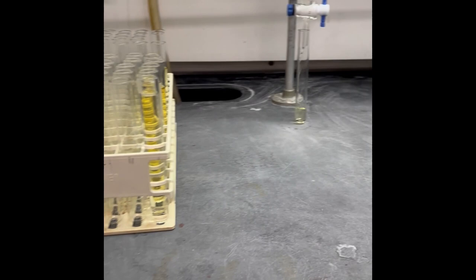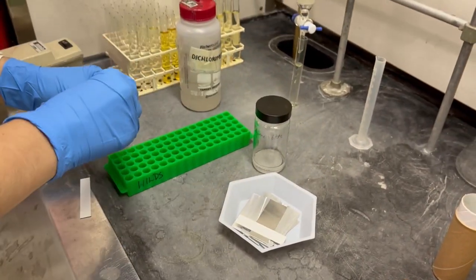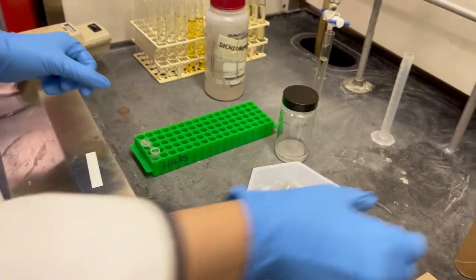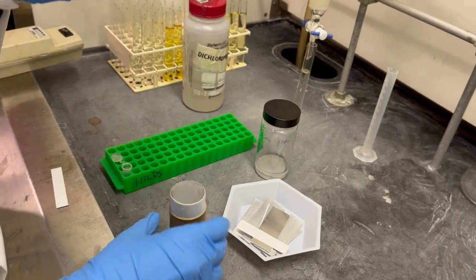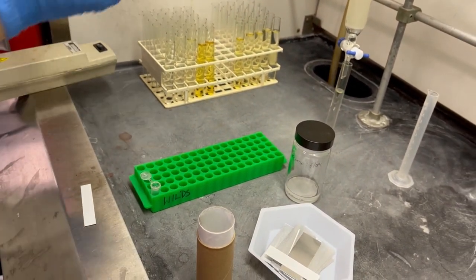The next crucial step is to identify which fractions contain the product. As mentioned earlier, we use TLC to determine the composition of the eluents or fractions. This step is done during collection and it does take some practice to coordinate it all.